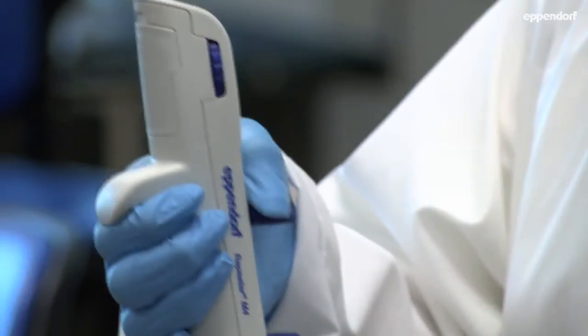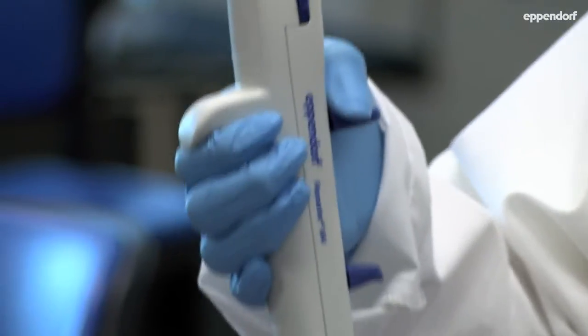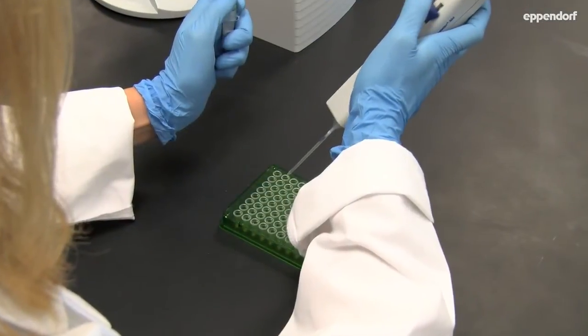Using positive displacement technology, the Multipet M4 delivers unmatched precision and accuracy when dispensing your sample.